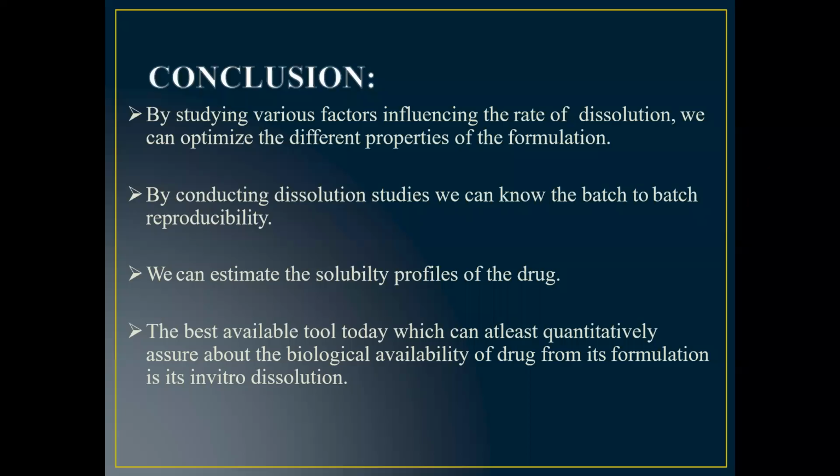By using in vitro dissolution methods, we can predict the in vivo performance of the formulations. We can have some idea how the drug is going to behave in the actual biological system with the help of dissolution. We can also predict batch to batch variations and lot to lot quality of the drugs. Okay, this is about dissolution.